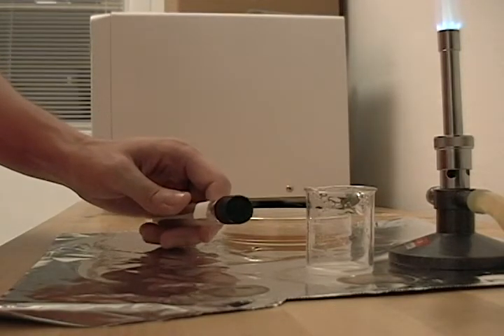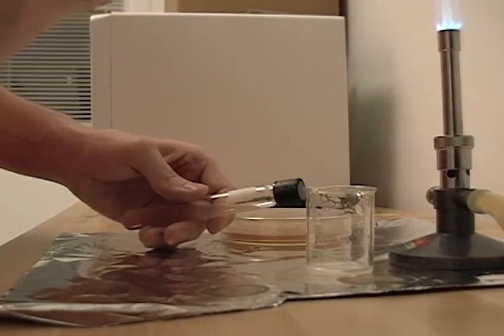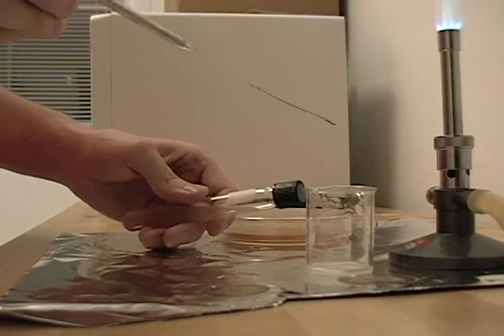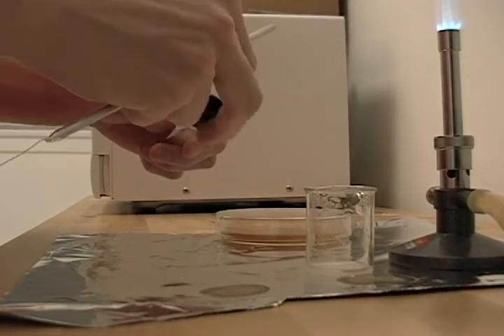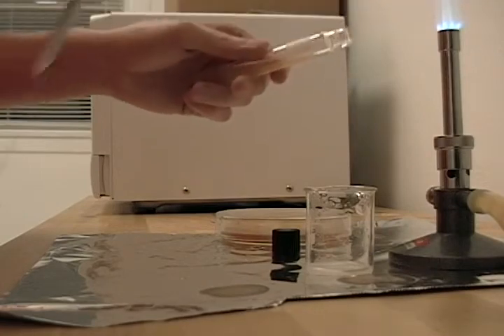Going to loosen up the lid on the slant tube. I'm going to pass my inoculation loop through the flame again. Wait for it to air cool. Completely remove the lid, flame the top a little bit.